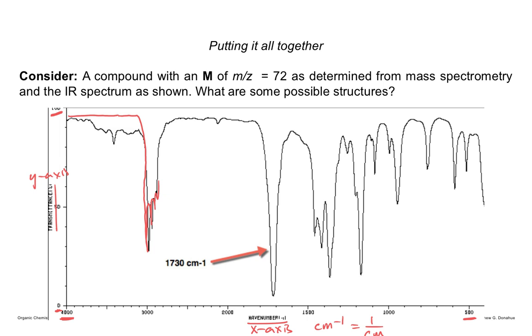So we left off last time talking about the parent ion having this mass to charge, and if it was 72, we did some assumptions through these intuitive techniques of, 72 has to contain C, N, H. If we divide that by 12, that would give us the maximum number of carbons. But what about this situation with oxygen?